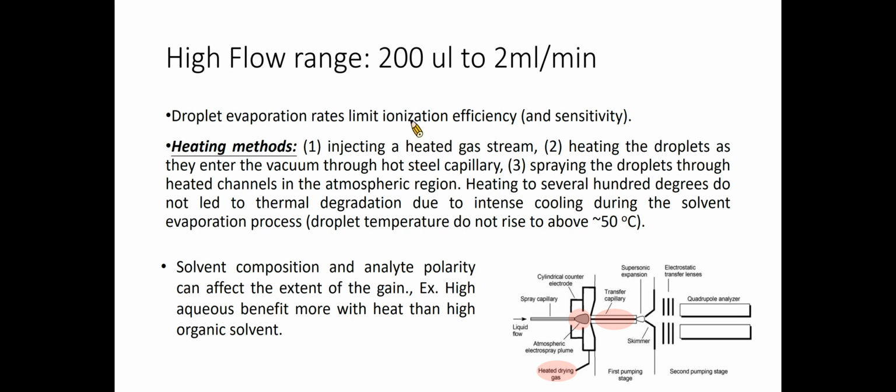The additional heating process will enhance the evaporation rates and thus increase the ionization efficiency. The extra heat can be supplied in three places: the drying gas, the transfer capillary, and the atmospheric region.